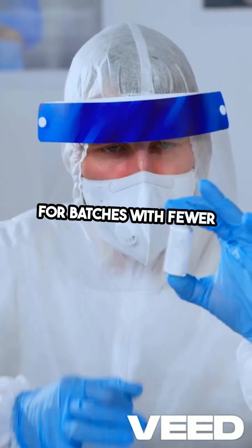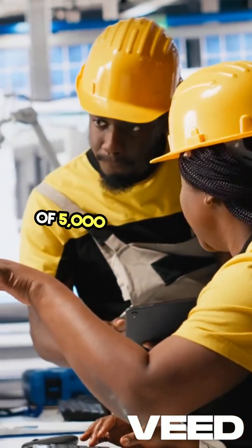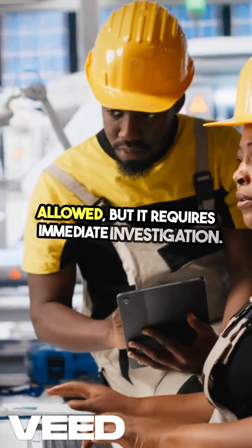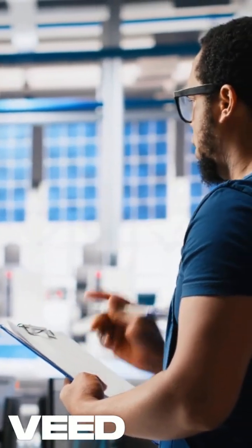For batches with fewer than 5,000 units, 0 contamination is acceptable. For batches of 5,000 units or more, up to 1 contaminated unit is allowed, but it requires immediate investigation. Any contamination, regardless of quantity, must be thoroughly investigated.